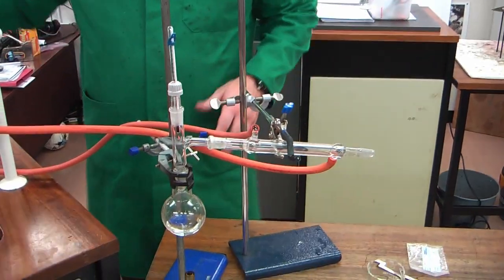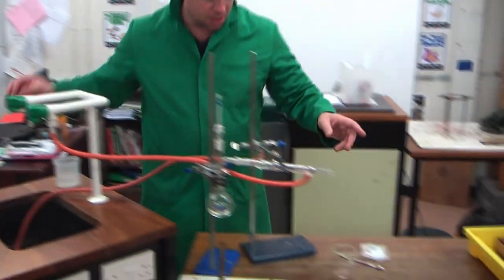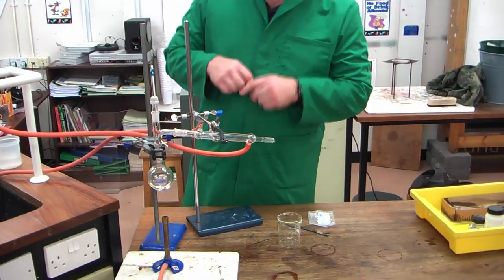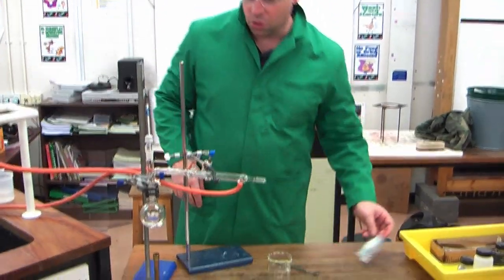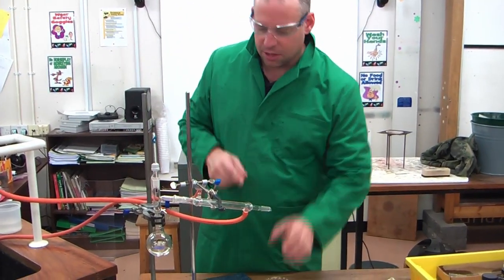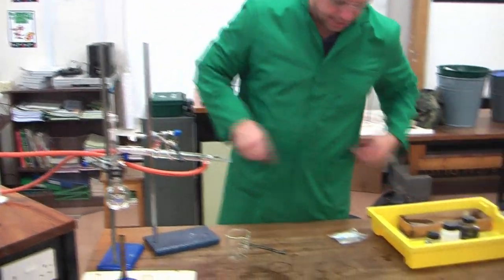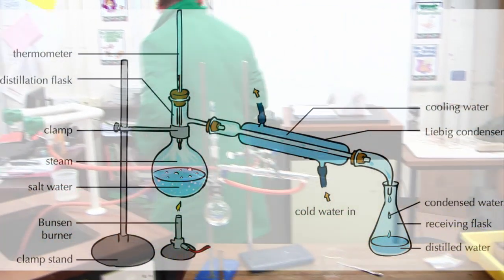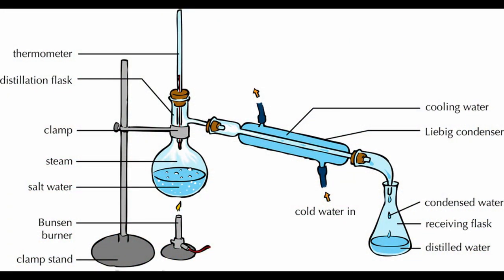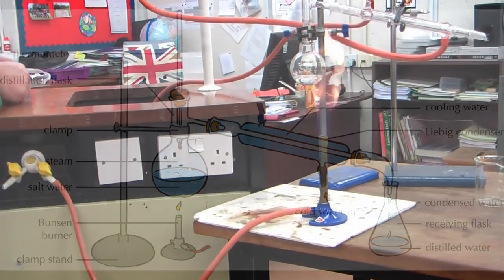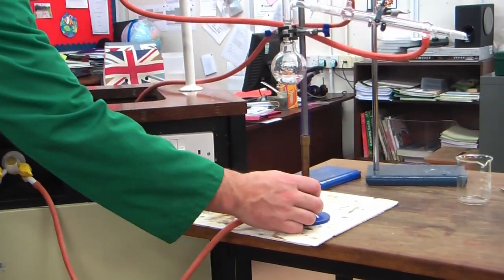So, anti-bumping crystals in, salt solution in, and I'll refit the side arm into there. Brilliant. The water, which you can see, is still running. So, the water's going up through, and that will hopefully cool off the water vapour as it comes, and condense it, which is why it's called a condenser. So, let us quickly light my Bunsen burner. Make sure it's on yellow flame, and away.